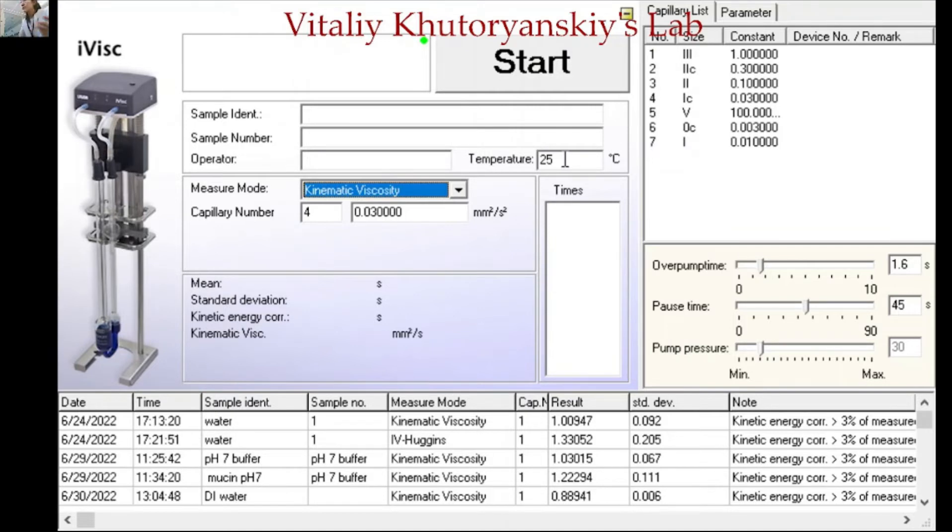For temperature, since we are using the thermostatic set at 25 degrees, we don't need to change it. Then enter the sample identity — for now it is the pH 9 buffer. You can also set the sample number and the operator. Please make sure there is a green indicator point, which means it is connected to the equipment. If there is a red point, it means it is disconnected, so check the equipment or restart the software. Once everything is set, click start.